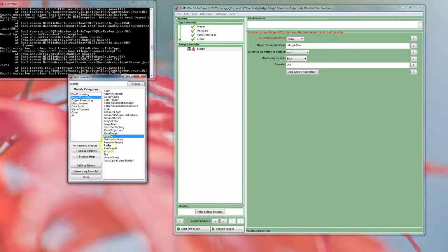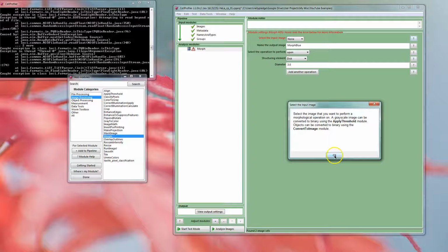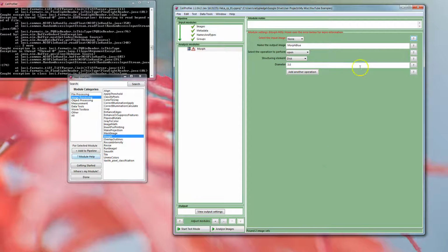When you double click there or add to pipeline, you can see it over here. The eye will let you know whether it's going to pop up a new window for you to see results. And this one here is saying there's a warning in the module, and the module details are over here. Each part of the module has a help section. It's like a breakdown of the module help, but relevant to the input you need to put in. So these are really good helps, so I suggest you click on anything you're not quite sure about. It will break down the information there.